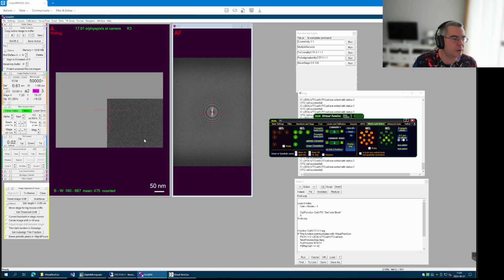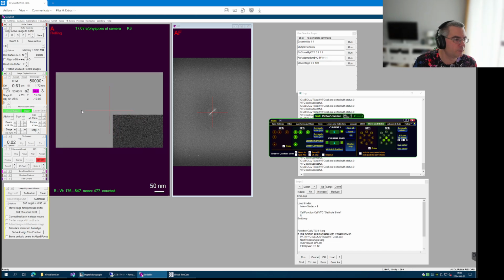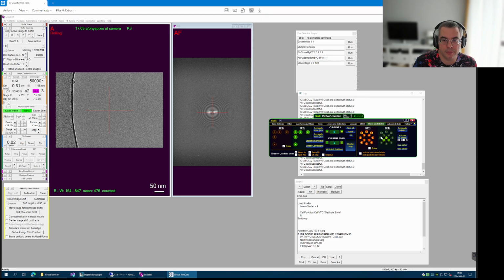And then maybe let's go max to the right. Sorry, to the left. That's the left-hand side. Okay, here we go. So let's say this is now my position 3. Yeah, and then I can go back to 0.